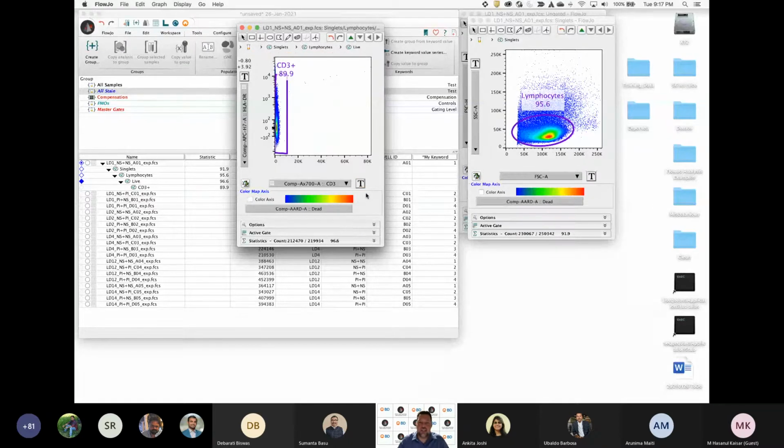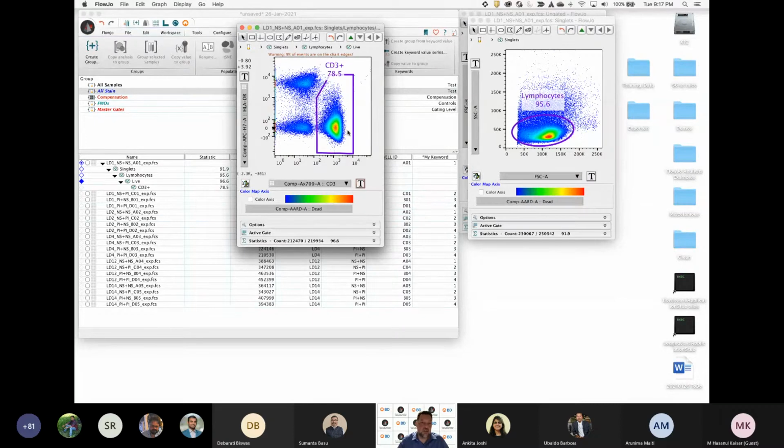A linear axis change will squish everything initially. You can still change the range and pull it all out, but it won't be appropriate for most immunological markers. In the case of certain dyes, you do want to use a linear axis, if you're doing proliferation or cell cycle analysis. Then you would want to use a linear axis for those parameters. But in most of our standard antibody staining, we're going to be looking on a log scale of 100 or 1,000-fold difference between negative and positive. So therefore, you do want to see the positives on a log scale.